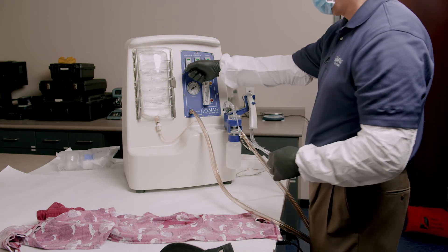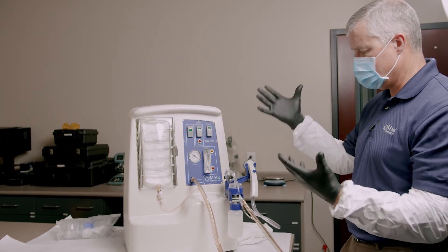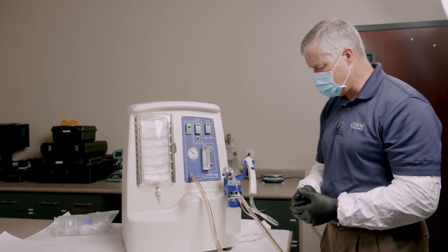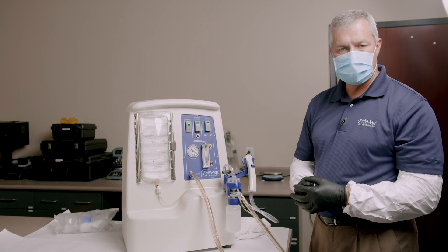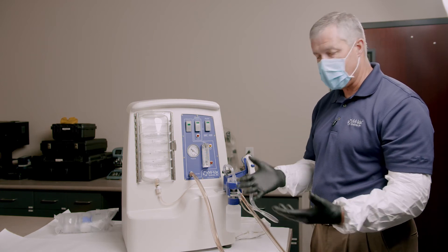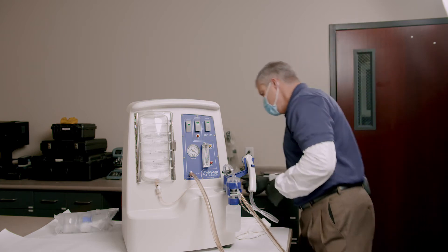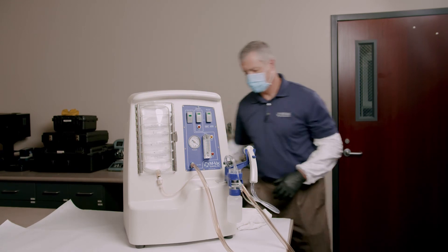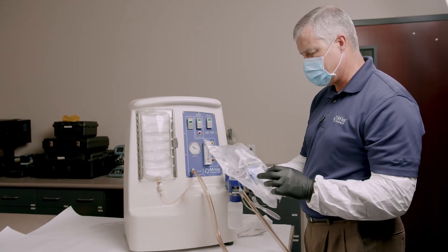You've now seen how we collect the sample. We've assembled it and taken a good sample. Now we have close to 200 milliliters of solution — all the DNA is mixed into that solution. Now we have to concentrate it. The way we do that is with this Nalgene filter.